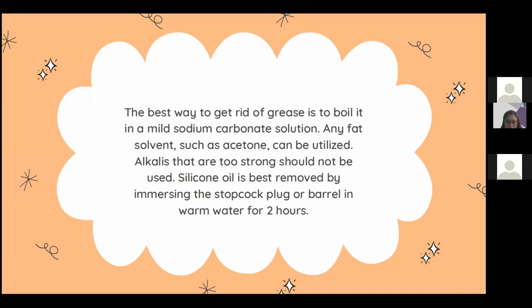Alkalis that are too strong should not be used. Silicone oil is best removed by immersing the stopcock, plug, or barrel in warm water for 2 hours. Some chemical substances, like sodium carbonate, acetone, fat solvent, and decahydronaphthalene can be used to remove this grease.